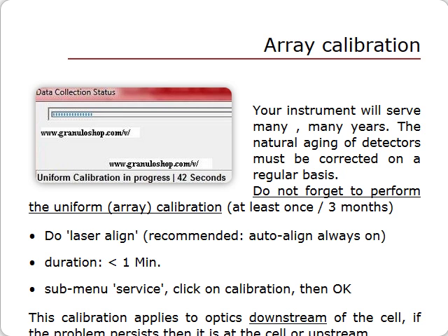Calibration is fast and lasts only 42 seconds. In the service menu, click on calibration, then OK. Also align the laser — we recommend that you check the laser auto-align option. This detector calibration applies to the optical path past the sample cell and may be enough to get the set zero to pass. Yet if the set zero alarm keeps being triggered, we can suspect a problem upstream, most likely the sample cell. No matter what, do not forget to perform the array calibration on a regular basis.